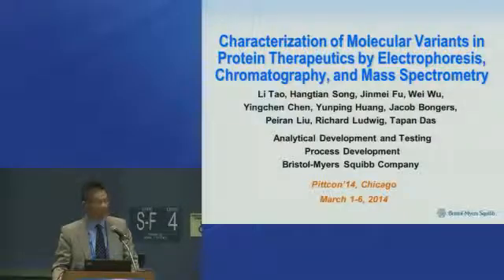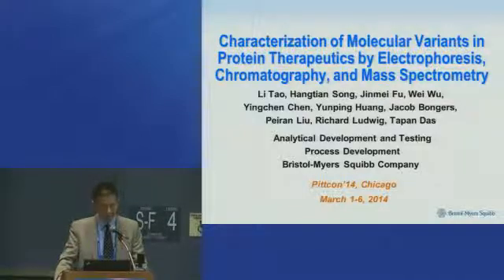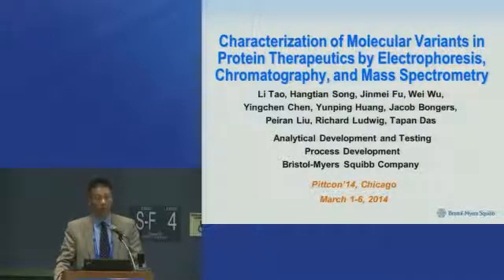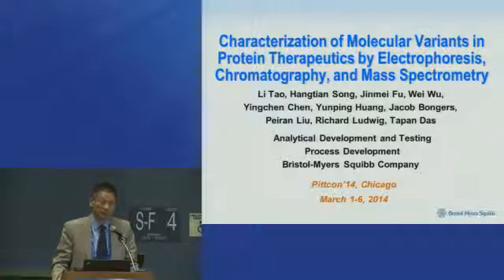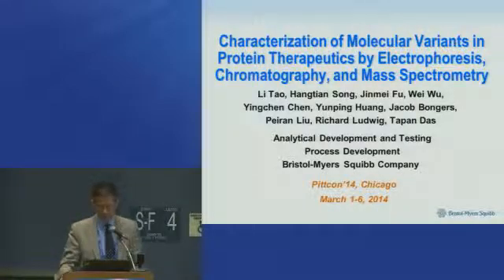As you can tell, we have a pretty diverse group. The majority of the people here listed are mass spec people. Most of our work uses mass spectrometry, but we do provide chromatography analysis. As you can tell, the real power of mass spec actually comes 50%, maybe, from the separation. The rest came from mass spectrometry.